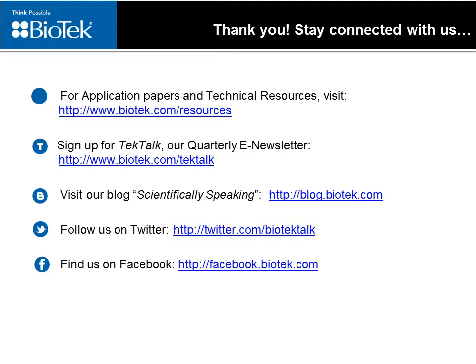The question is about how the counts are achieved. All these counts are done automatically through Gen5. So you get readouts of the cell number in real time, and those are all compiled, essentially just counting the number of objects in the field. And those are compiled over time, and those are what are used to either have a readout of cell number at any given time or for the kinetic analysis. So yeah, that's completely automated.